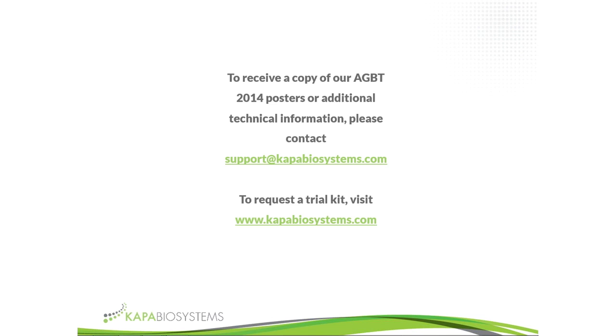So that's a really interesting question, and something that we've had long debates about. As I mentioned, initially we thought that one of the key bottlenecks in FFPE library construction is the inability of the normal formulation of Hi-Fi to copy adapter-ligated DNA made from FFPE samples that contains the deaminated and oxidized bases. And so, yes, we thought we'd just solve the problem by using Hi-Fi Uracil Plus, and part of the problem does get solved. So when you use U Plus instead of Hi-Fi for library amplification, provided that your amplification conditions are well optimized, so you don't run out of primers, you do get higher yields of adapter-ligated library.